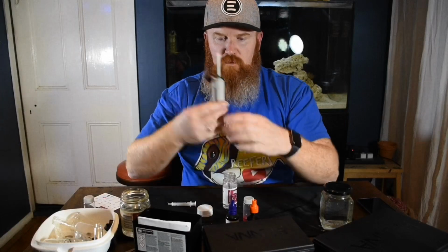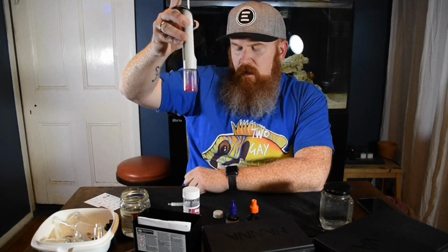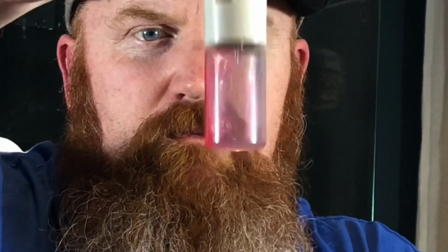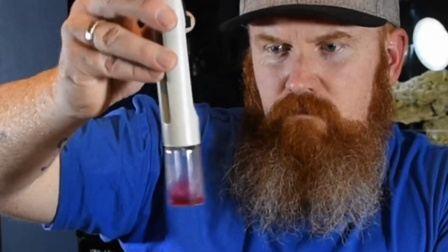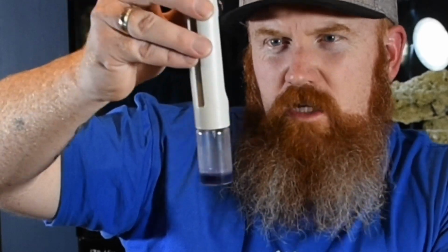So you put it into this contraption thingy, screws onto the vial, and then drop by drop, put it in, and you're waiting for the liquid to turn blue. That's a nice blue there.